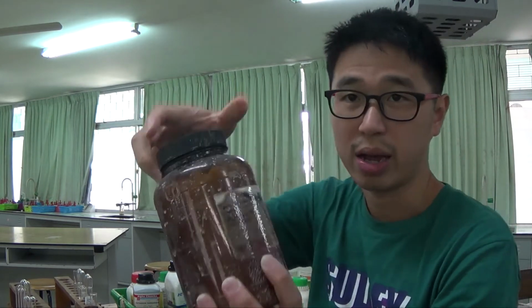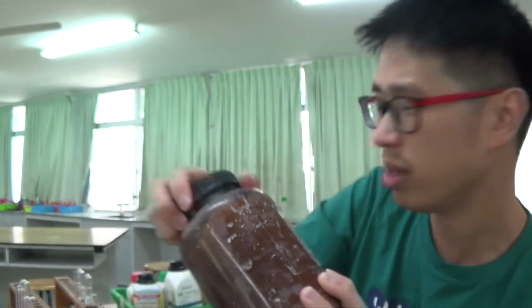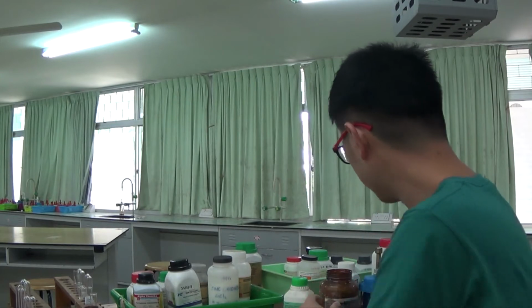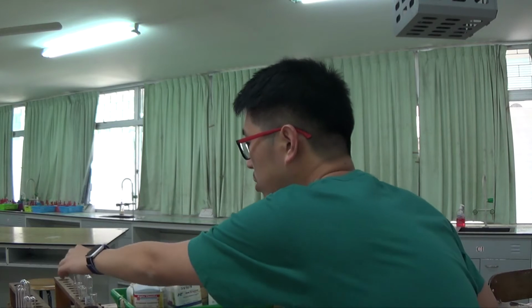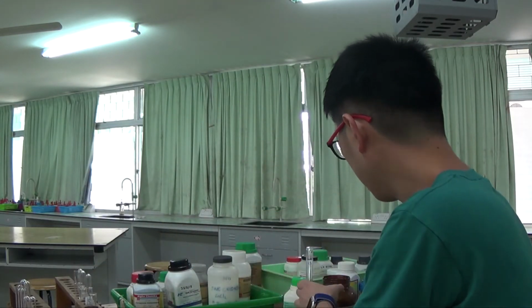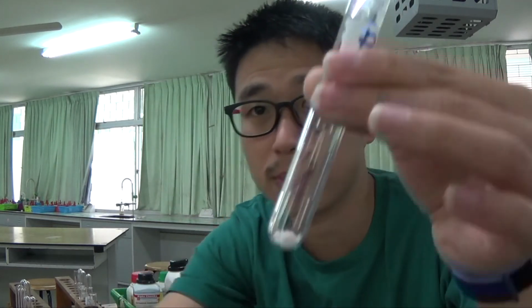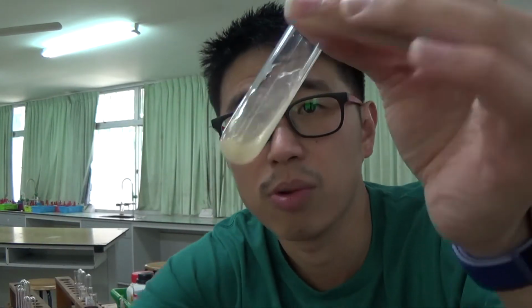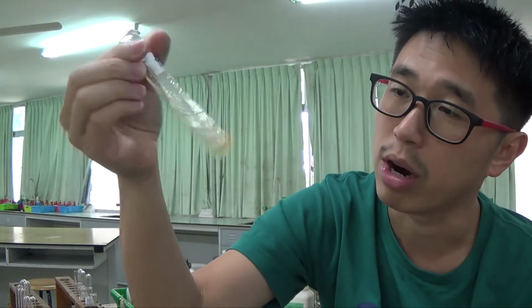So now I have this thing, ammonium iron 3 sulfate. Doesn't matter what the anion is, I'm more interested in the cations. So this is also a double salt, but I already tested for the ammonium ions in my other video. So what I'll do here really is I'll just dissolve this in water. It looks like a white solid, but when I dissolve it in water, it gives me a brown solution, an orangey brown solution.